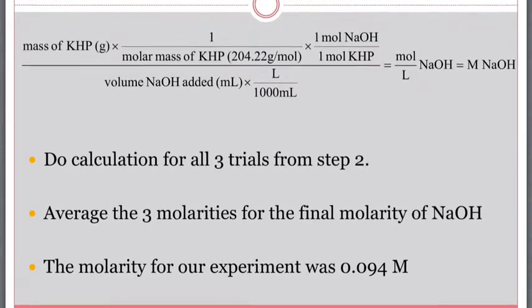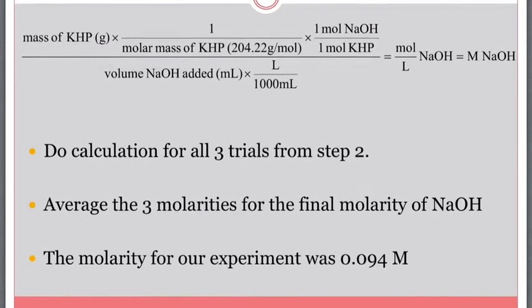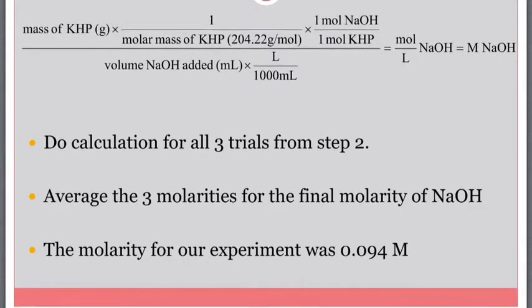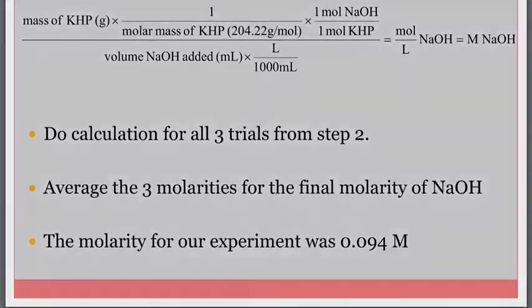We did this process 3 times in step 2, so we're going to average out the 3 trials, which will give us our standardized NaOH molarity. In our experiment, the NaOH ended up being 0.094 moles per liter.